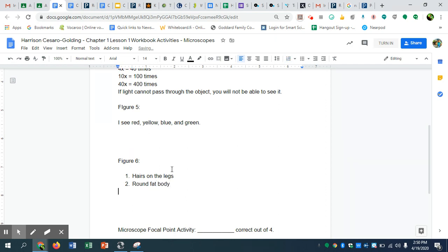And 3, segments. Legs made of segments, you could write. And again, you don't have to write mine. It's really just what you observe too. I'm going to put number 4. I see a cute face. That's my opinion.